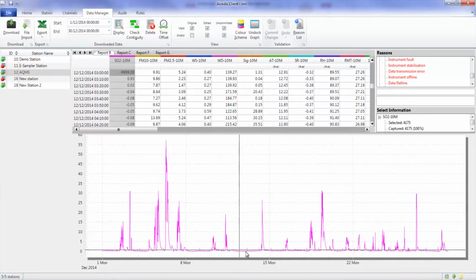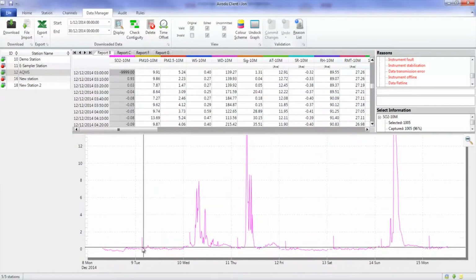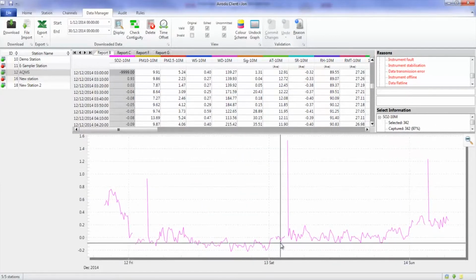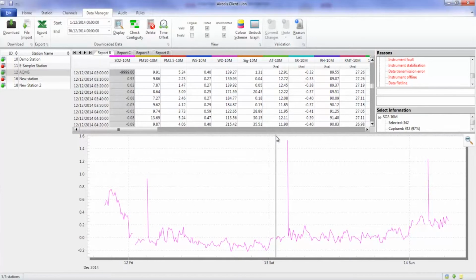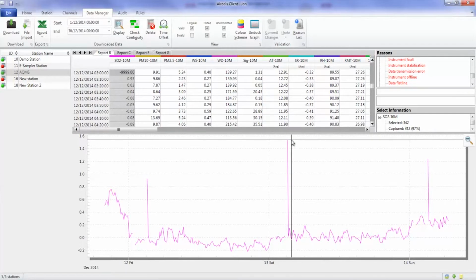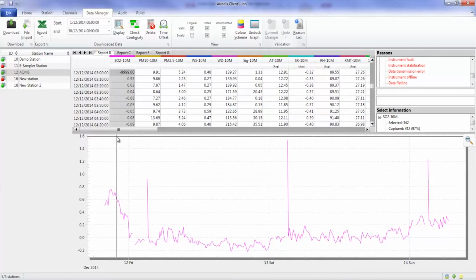every day. If we zoom in, we can see that they're a little gap followed by a spike, and I can identify these as being overnight span calibrations, where the calibration itself is removed by the logger. You can see these values here, but then a little value after the calibration is being left in due to a timing issue, perhaps with the logger or the instrument. So if we were going to be reporting this data, we wouldn't want to include those values.